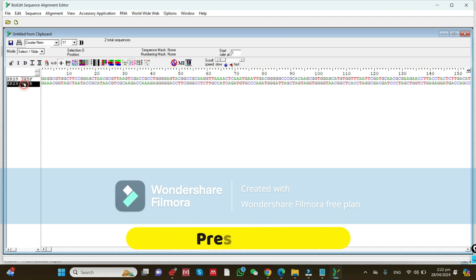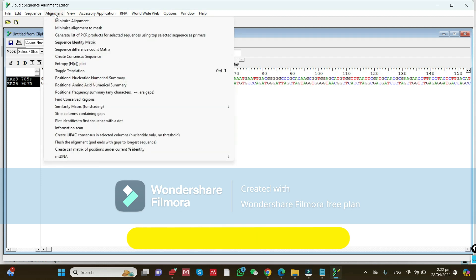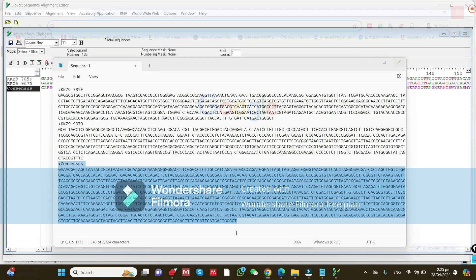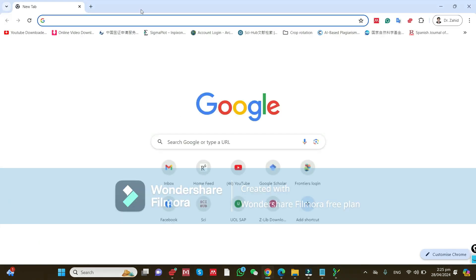Now select both the forward and reverse complement sequences by pressing Control on your keyboard. Then go to 'Alignment' and click 'Create Consensus Sequence'. It will show the consensus as a third sequence. Click 'Create Consensus Sequence' and here it is — the third consensus sequence.